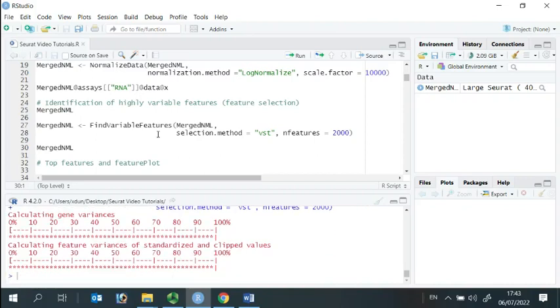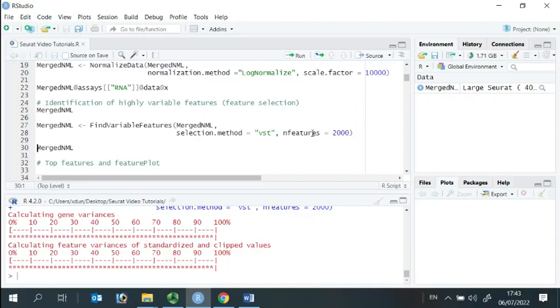By default, this function uses a selection method called variance-stabilizing transformation and retains 2,000 variable features. Studies have shown that using variable features in downstream analysis could highlight the biological signaling pathways in single-cell data analysis.